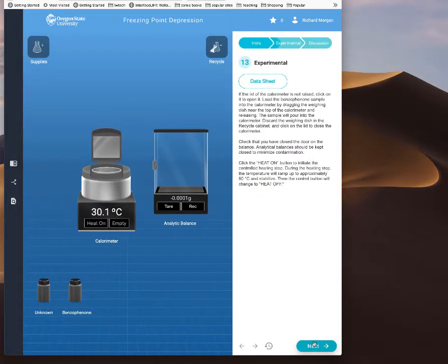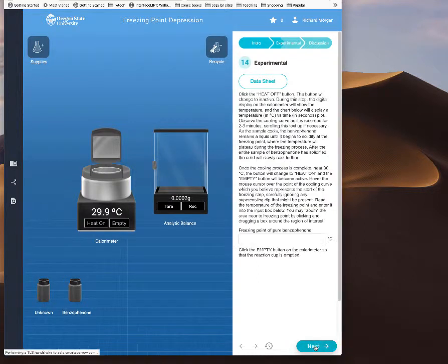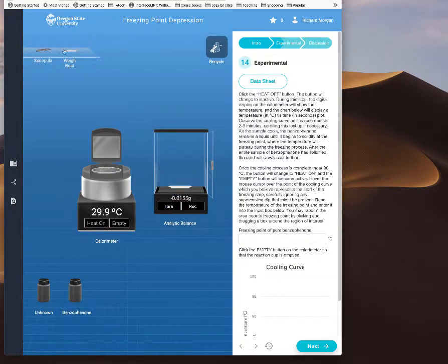We're going to go through and get the temperature of the solution, the regular melting point. I'm going to do this, but I'm going to cut these parts out so you don't have to watch it. I'm going to put the weigh boat on here and tare it. Then I'm going to take this and get 5 grams of the solution. I better make sure it's nicely tared.